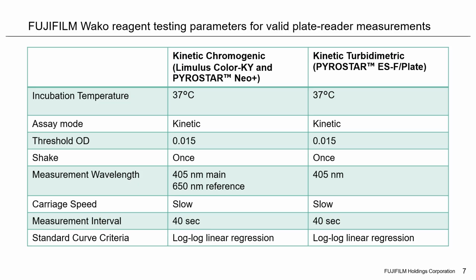Incubation temperature of 37 degrees Celsius throughout the read. Of course, assay mode of kinetic. I mentioned that threshold optical density of 0.015. We ask that you perform a shake at the beginning of the protocol before the reads start. The shake, we often recommend around 10 seconds on a medium constant speed. Measurement wavelength is where these two methods do diverge from each other. Both require a measurement at 405 nanometers.